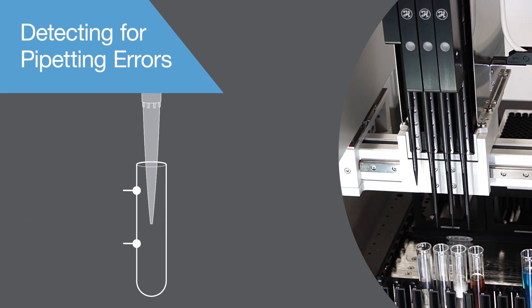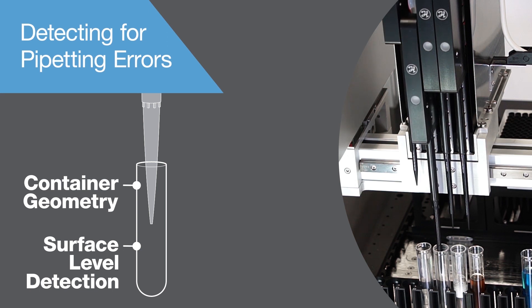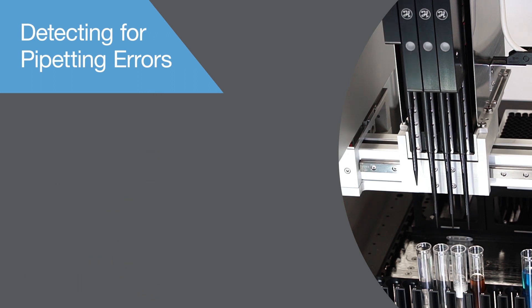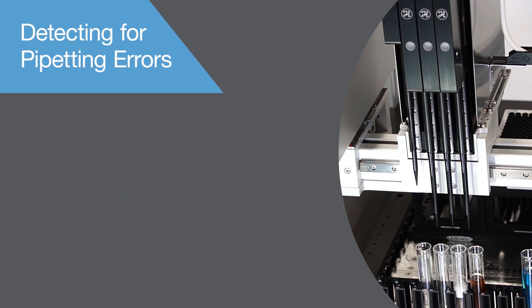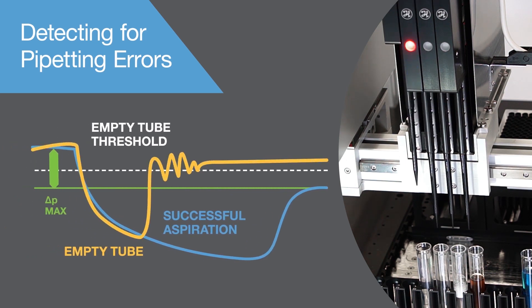ZOOS channels know if a well contains insufficient liquid, based on the liquid surface detection and the container geometry. The channel will alert the control system of this exception. Additionally, if the ZOOS is commanded to pipet from a set height and insufficient liquid is present, the ZOOS channel will detect the aspiration of air by comparing the post-aspiration channel pressure to a preset pressure threshold.